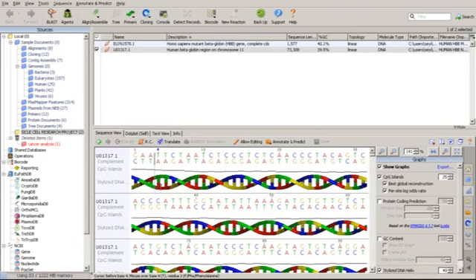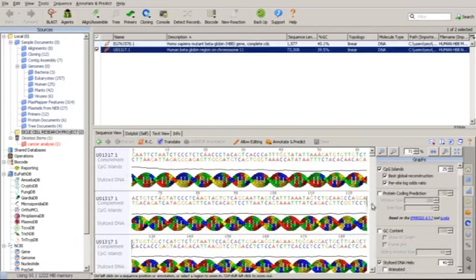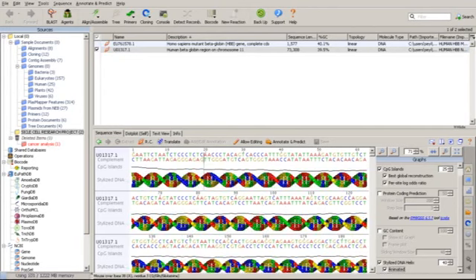A, which is the double strand of this sequence. Now the first strand is T, which is blue. So you can actually view the animated form of this DNA helix, I mean the moving form. You can just click this animated and then you see it moving.